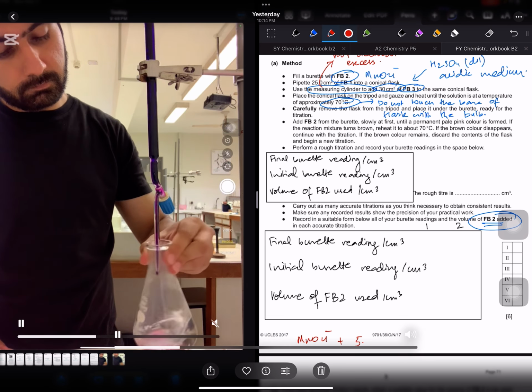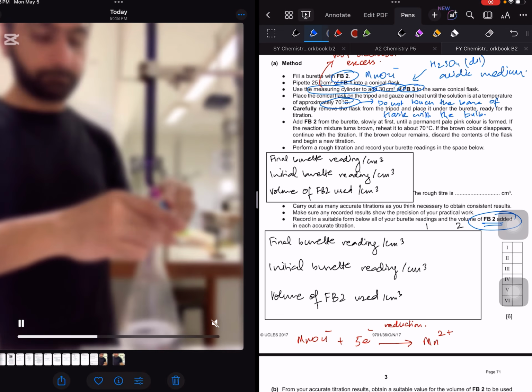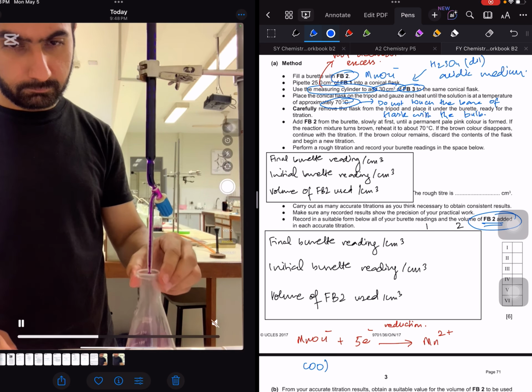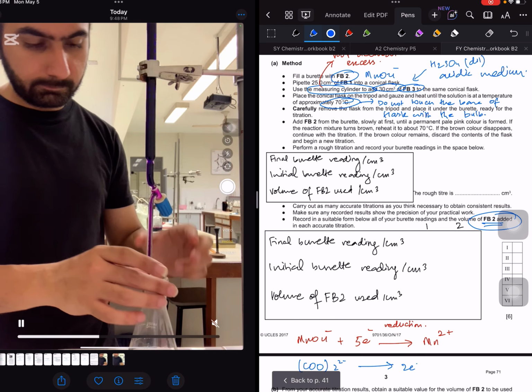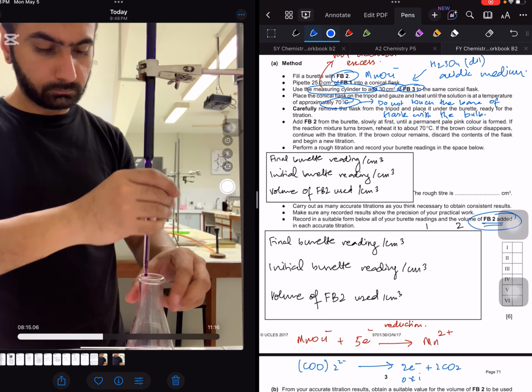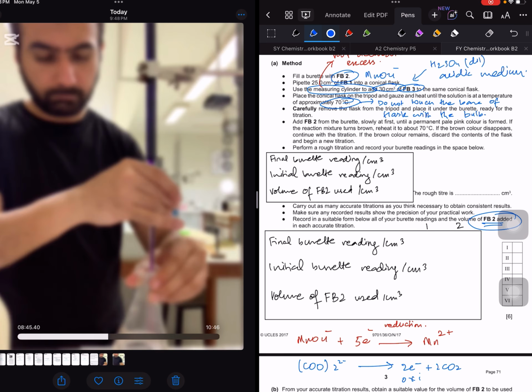Manganate gains 5 electrons and becomes Mn2+ ions, which is a kind of reduction. And ethane dioate ions basically lose electrons and become carbon dioxide gas, which is a kind of oxidation. So I'm just going to move past it. You can see me adding some water in it just because a little got stuck on the wall, but that's okay.